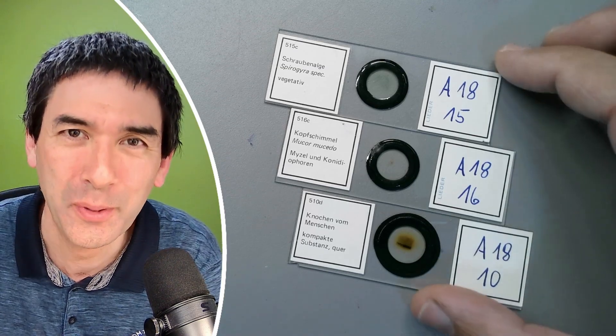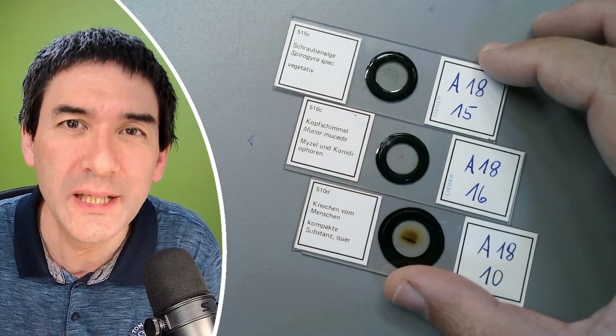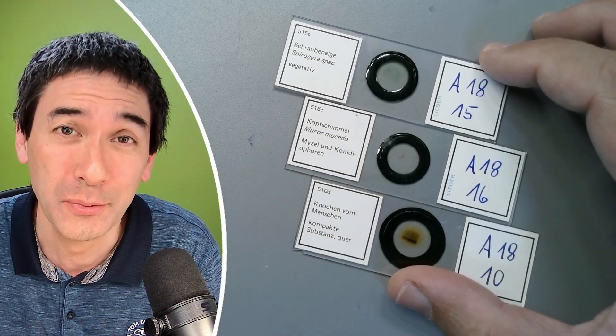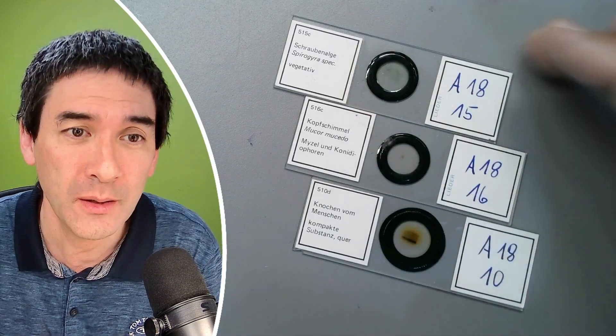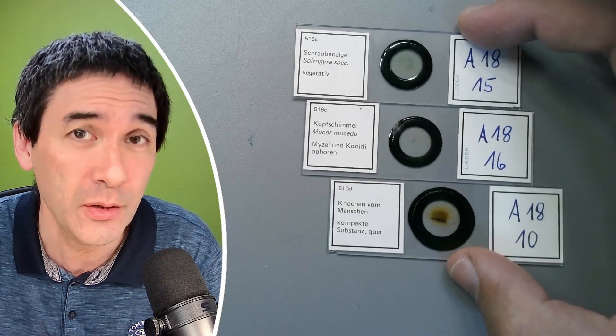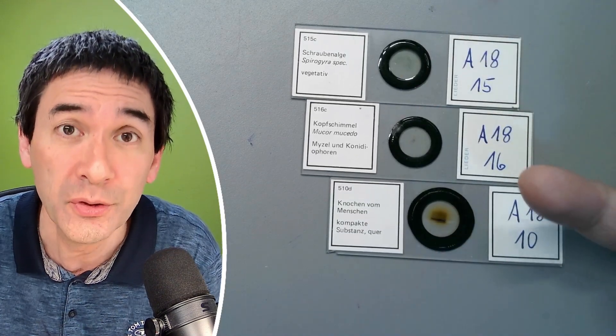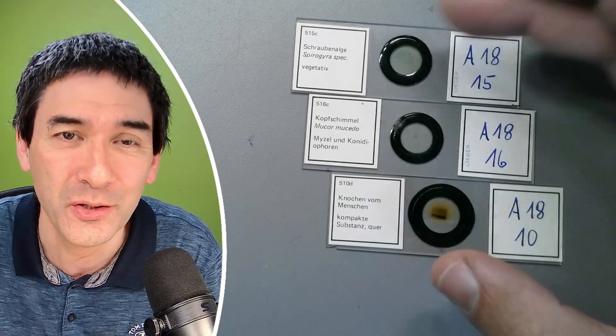So hi, hello and welcome again. Microbe Hunter here and today I would like to talk about the ringed microscope slides and why some people choose to actually put a ring around the cover glass here. And the question is now, why is there a ring around it?